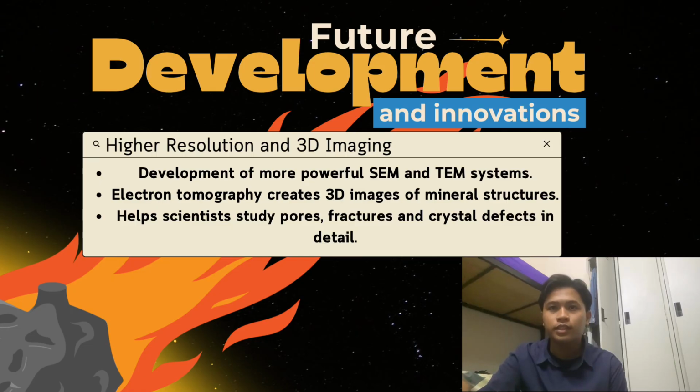The second development is higher resolution and 3D imaging. Future scanning electron microscopes, or SEM, and transmission electron microscopes, or TEM, are being designed with improved resolution, allowing scientists to observe even smaller features in geological samples. In addition, electron tomography can reconstruct a series of images into a three-dimensional model of a mineral structure.